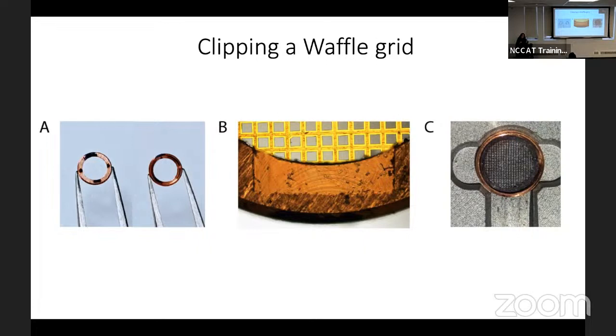It was pointed out that technically diamond shape would be the best because it would allow you to make a longer lamella. But once you move it to the right or the left, you start hitting grid bar within your pre-cuts. So you don't have enough wiggle room with the diamond unless you're super sure for some reason that your surface is pristine. And that's just how the grid looks after clipped.